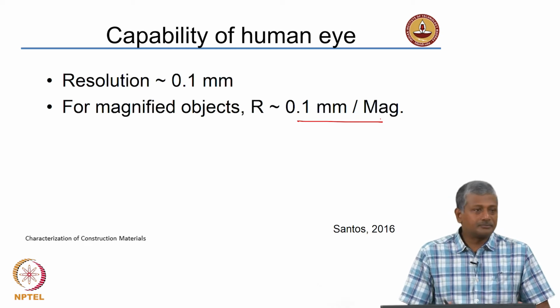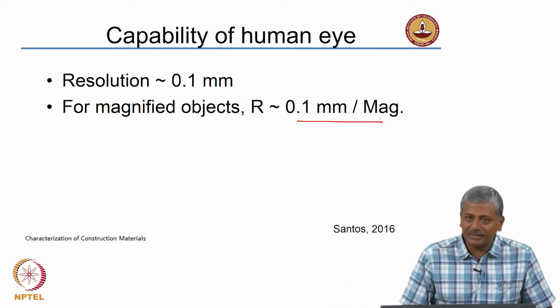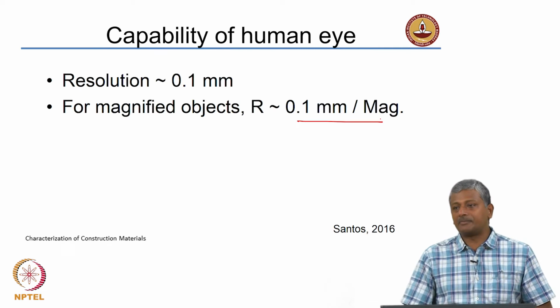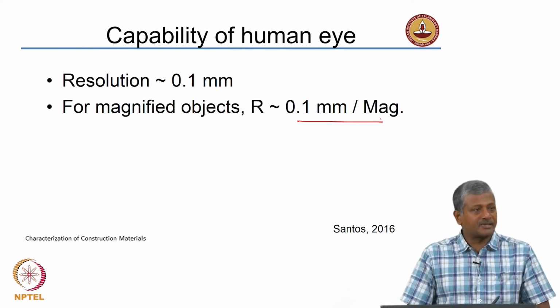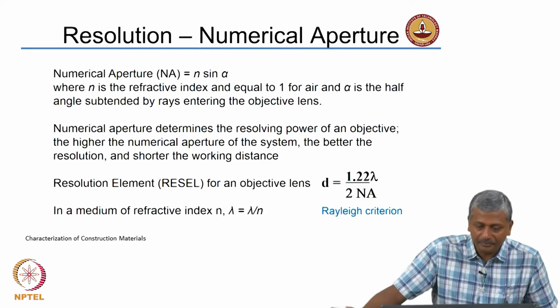Okay. So, those are some things that I can see for myself, but for a lens obviously the resolving power will depend on the kind of structure that your lens system has, the aperture, the amount of light, and all the other aspects that come within the optical microscopy realm.